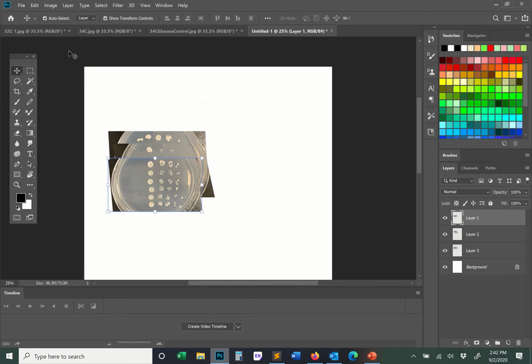Now, you might not work with yeast data, so you might be seeing this video and think this is completely irrelevant to what I do. But it's not, in the sense that you might, down the line, work with microbiology data, which is constructed on agar plates. You're looking at growth of some microorganism. So in general, extract the main points that I'm saying here and apply this to things you might work on, despite the fact that you might not actually work on yeast.